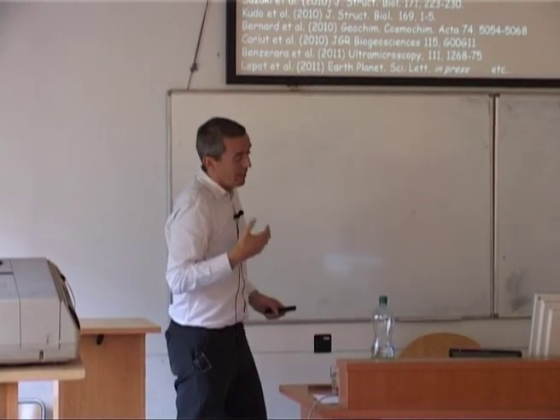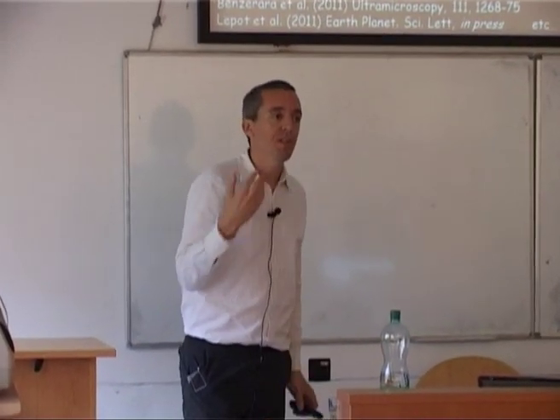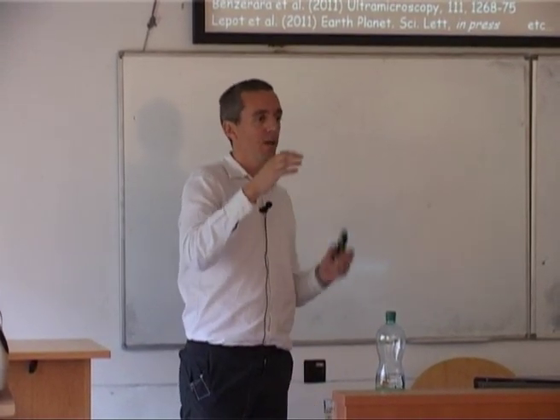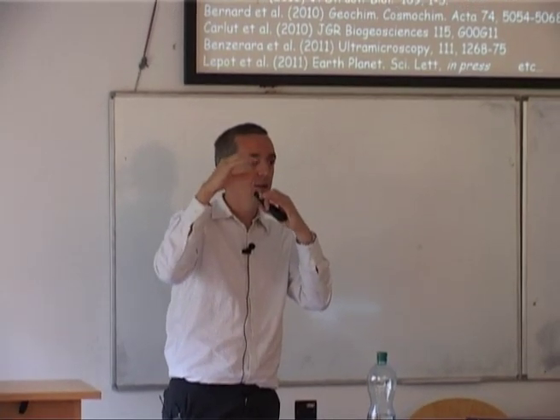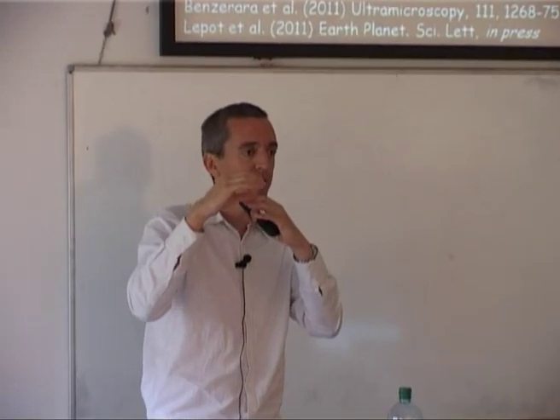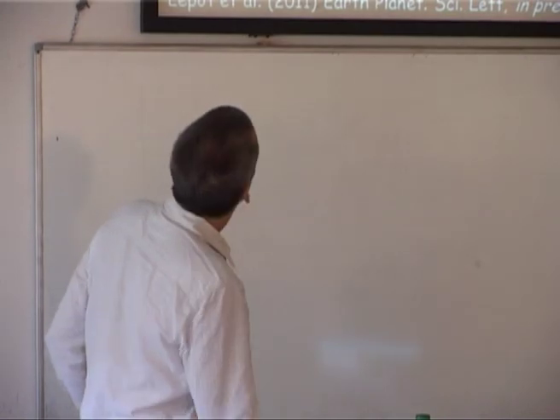And so this technique, you can use it not only for meteorite sample, you can also use it for interfaces between microbes and minerals, and you can preserve the contacts between microbes and minerals. And this is one example.